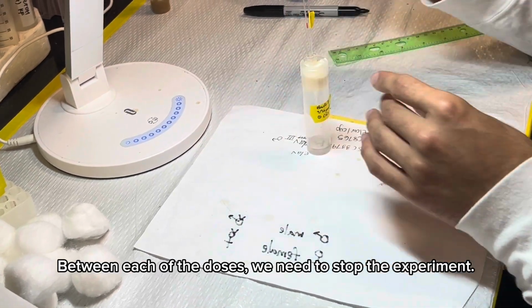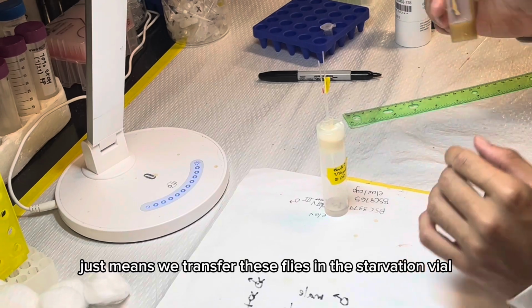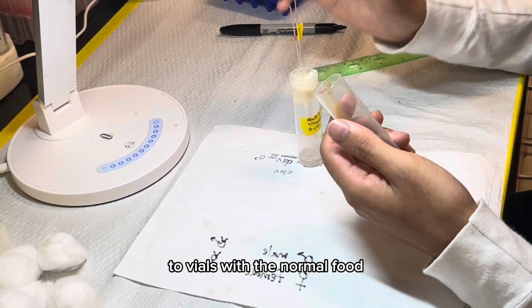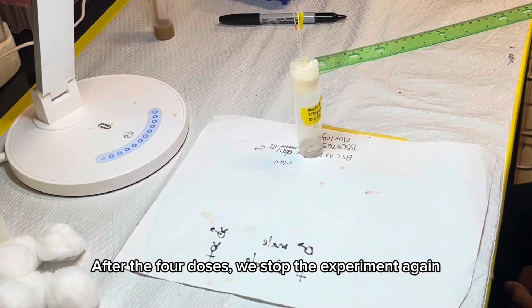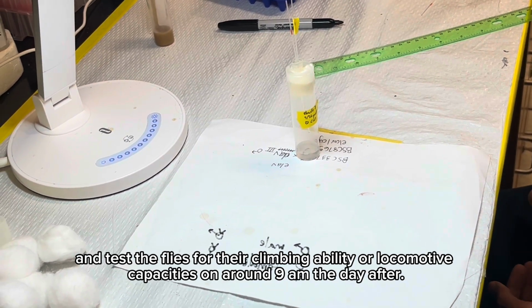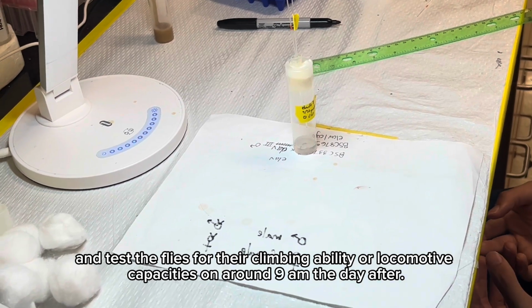Between each of the doses, we need to stop the experiment. Stopping the experiment just means we transfer these flies from the starvation vial to a normal food vial, and keep those in the incubator as well. After the 4 doses, we stop the experiment again and then test the flies for their climbing ability or locomotive capacities.